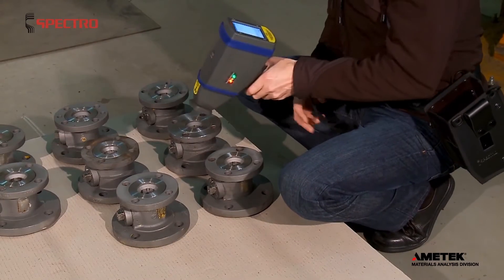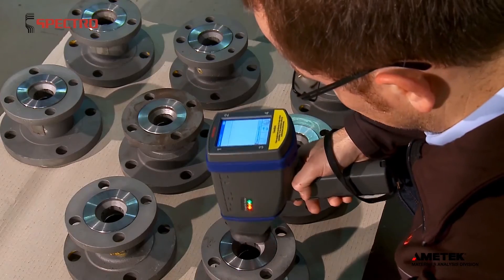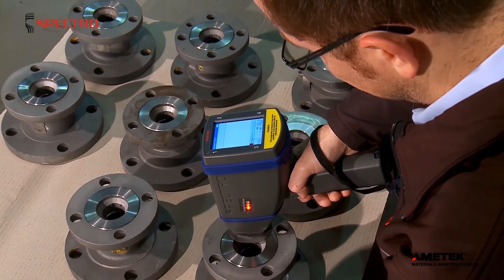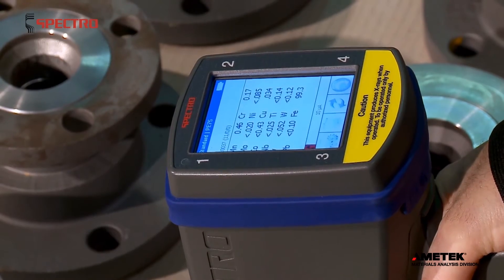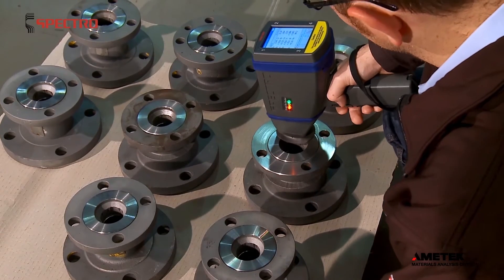Outgoing inspection on safety-related parts often requires 100% testing. Just remove the analyzer from the supplied holster and take your reading. For most alloys, Exsort requires only 2 seconds for each measurement.